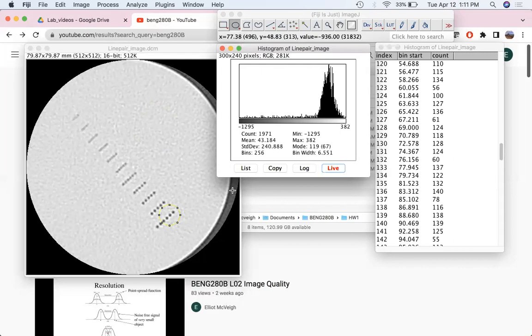Here it's -936. And in the background here, it's 77. See, -936 and 77. And so you can look at individual pixels that way. Here we're looking at all of the pixels inside this circle or ellipse, and you get a primary Gaussian for the background pixels that we just saw. And then these dark ones have all of these values in here.